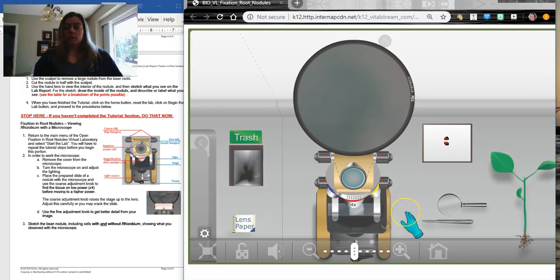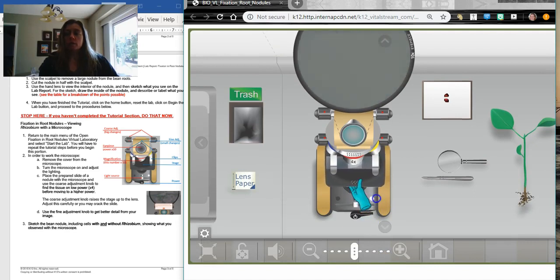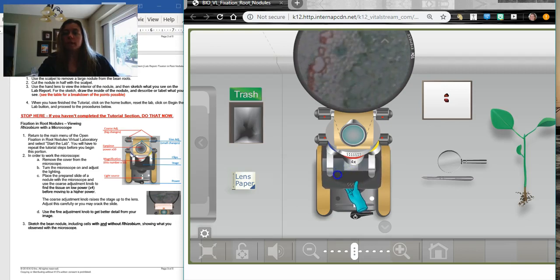Okay. All right, so what you need to do is find the specimen on low power before you zoom up onto high power. So let's find that. We're just looking for something that looks like there might be some shade or something to look at. Oh, here we go. It can be really tricky to move, so you've got to move slowly. But here you go. Here are the cells. And once you have it, you can move it around and find a good spot to look at. Well, there's a good spot. Let's look at these.